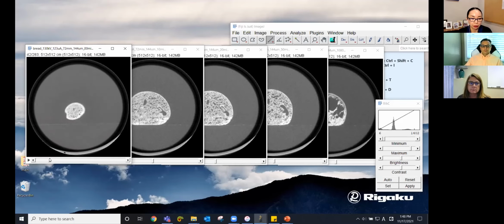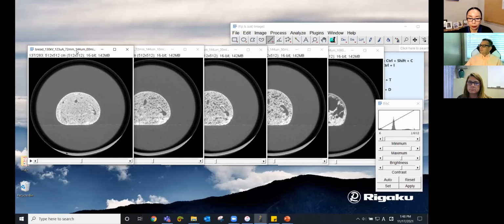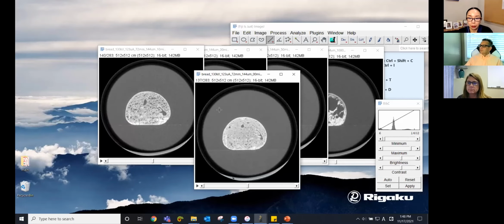So this is the Z direction, and you also want to scroll through time, so you want to create the time axis. That's the last exercise we're going to do. But to do that, I want to make this file a little bit smaller, because when you combine 5 CT scans, that can be a really big file. So I'm going to focus on this one, crop it, and also set the voxel size so that we can do some measurements later.